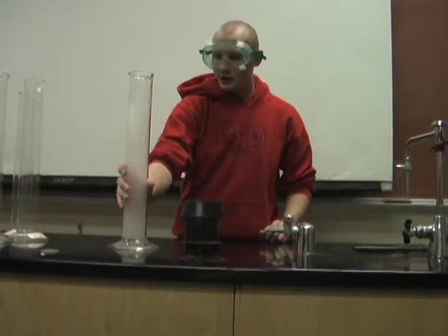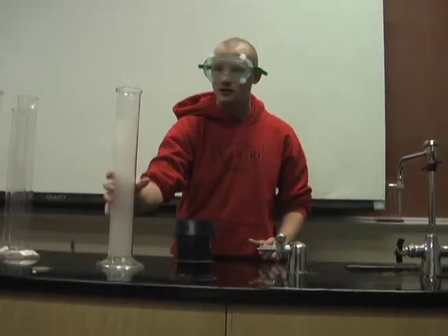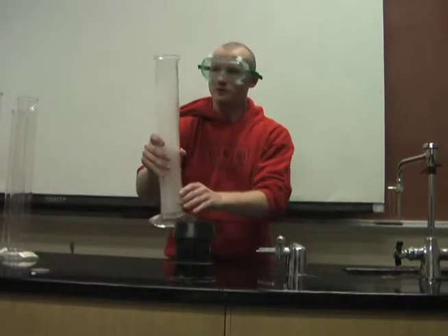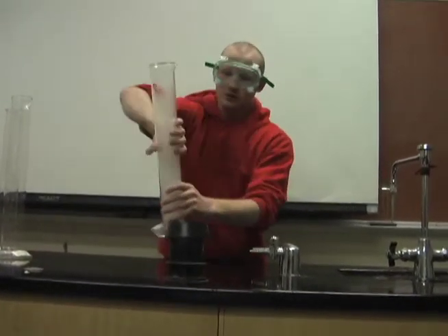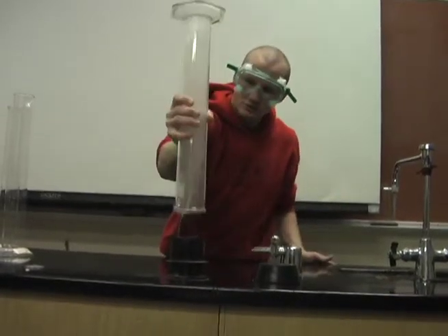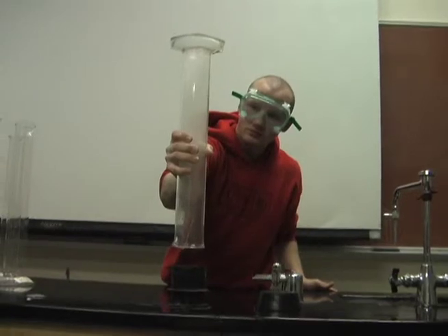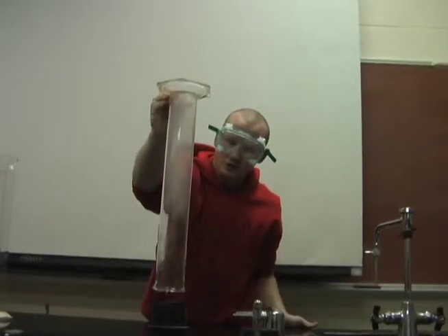Okay, so after we've already emptied these out, we still get a little carbon dioxide gas left in here, and since carbon dioxide gas is actually heavier than the normal air, it's just going to sit in here. And something fun we can do is with a vacuum, we can see it being sucked out.